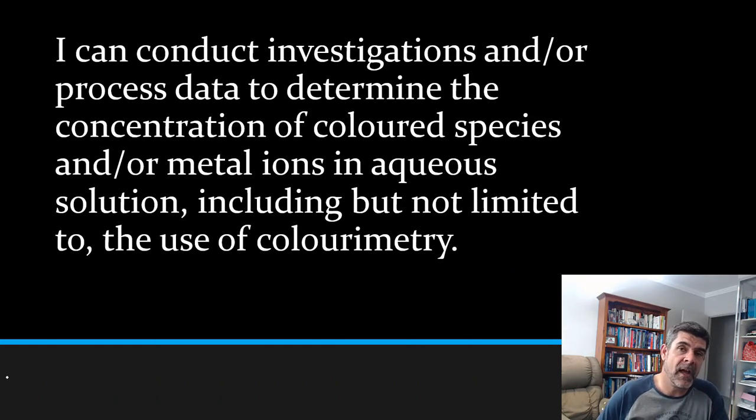So what we've looked at so far is a number of qualitative techniques for identifying the presence of ions in solution, and then we've looked at some ways of extending or changing the way that we do some of those procedures in order to turn those qualitative measures into quantitative ones. So precipitation reactions, which just identify the color or the presence of a particular ion through the formation of a precipitate, can be extended into more of a quantitative process by either collecting, drying and weighing those precipitates or through the process of precipitation titration.